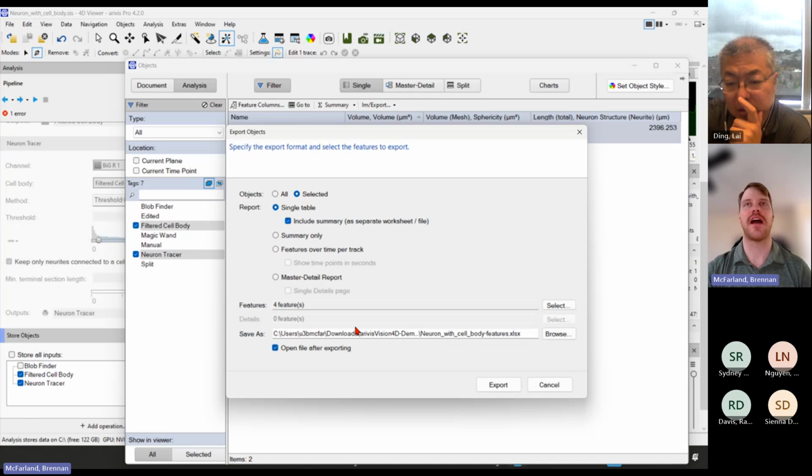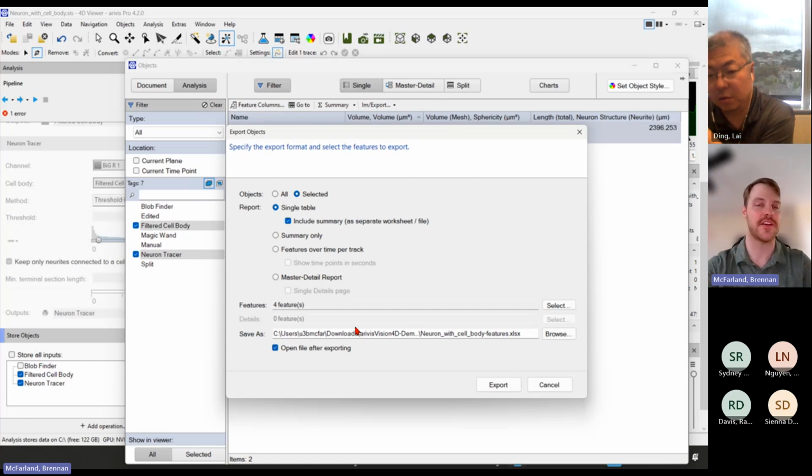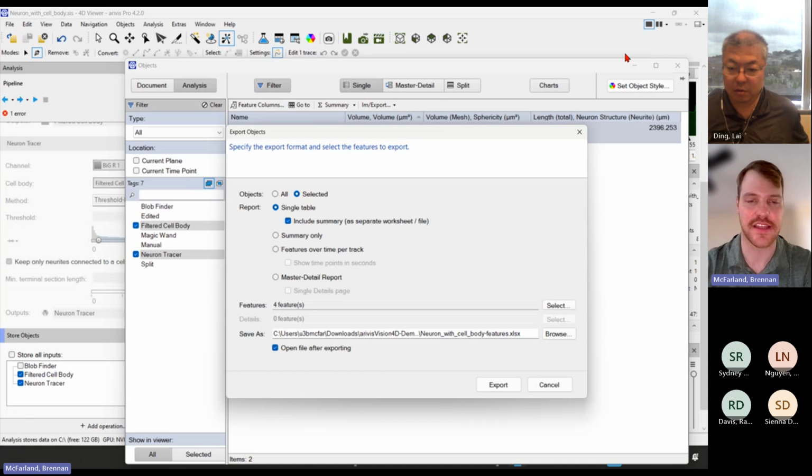You can say, if I have object A, that's like a nucleus, and it had 100 proteins within it, give me the Excel file where it says, here's object A of that nucleus, and then all the tag IDs of those children will also be reported. So then you just have to do like a finder or something like that, and you can associate them.